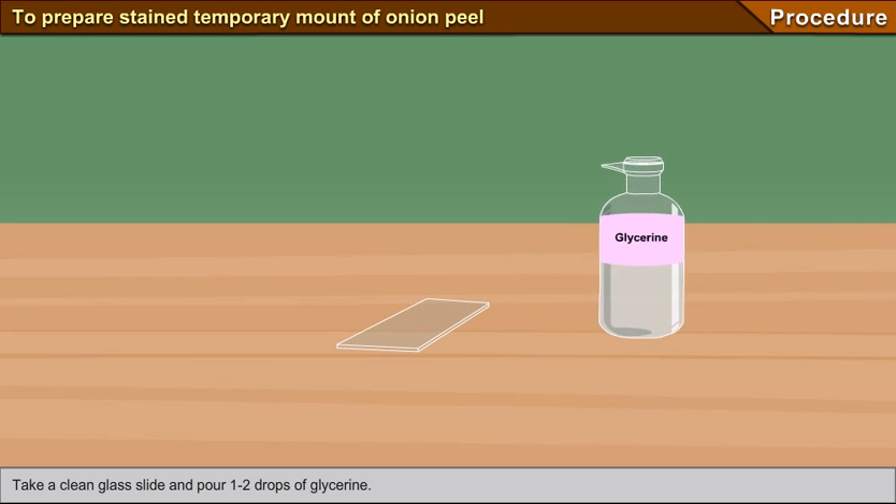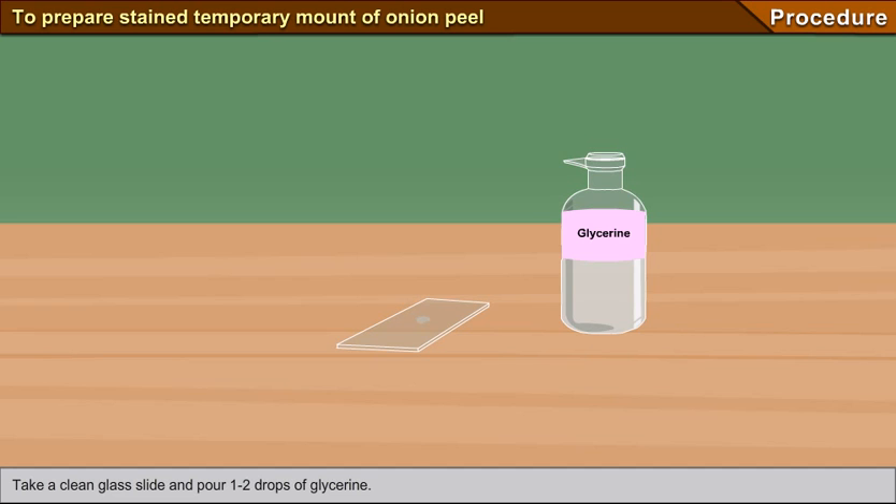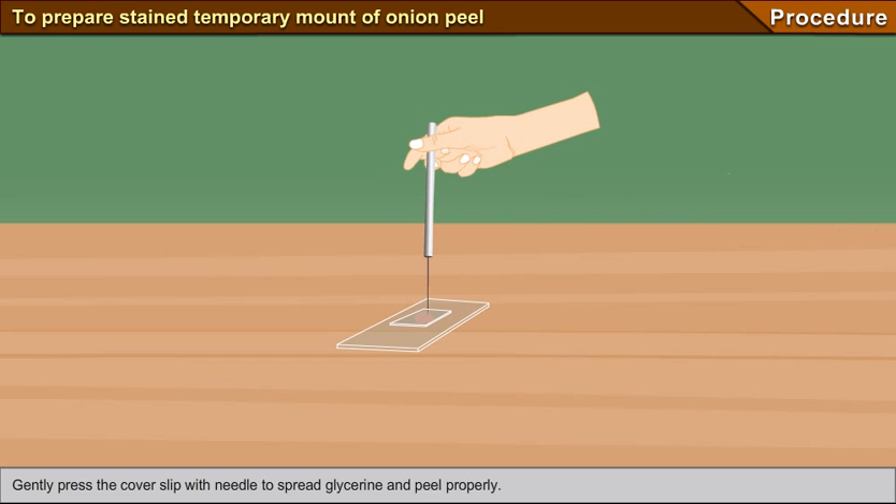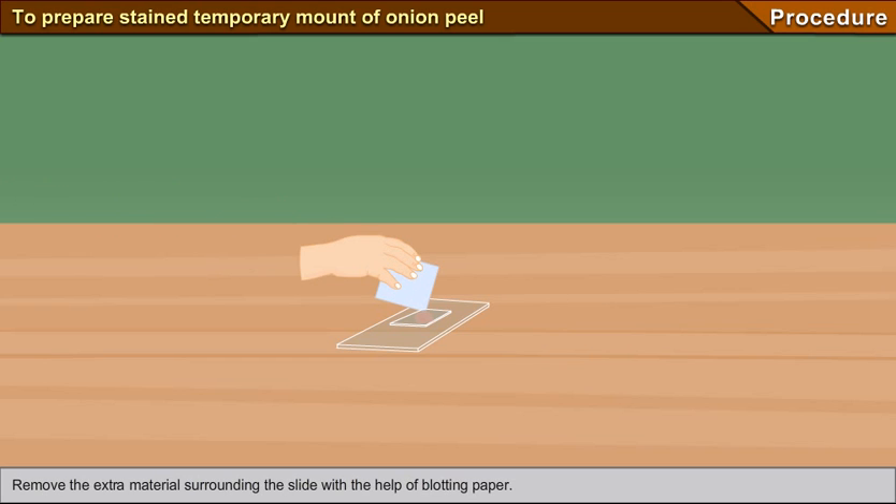Take a clean glass slide and pour one to two drops of glycerine. Transfer the stained peel onto the drops of glycerine on the slide with the help of a brush. The peel may tend to curl up — with the help of needle and brush, flatten the peel. Place the cover slip on the slide in such a way that no air bubbles enter. Gently press the cover slip with a needle to spread the glycerine and peel properly. Remove the extra material surrounding the slide with the help of blotting paper.